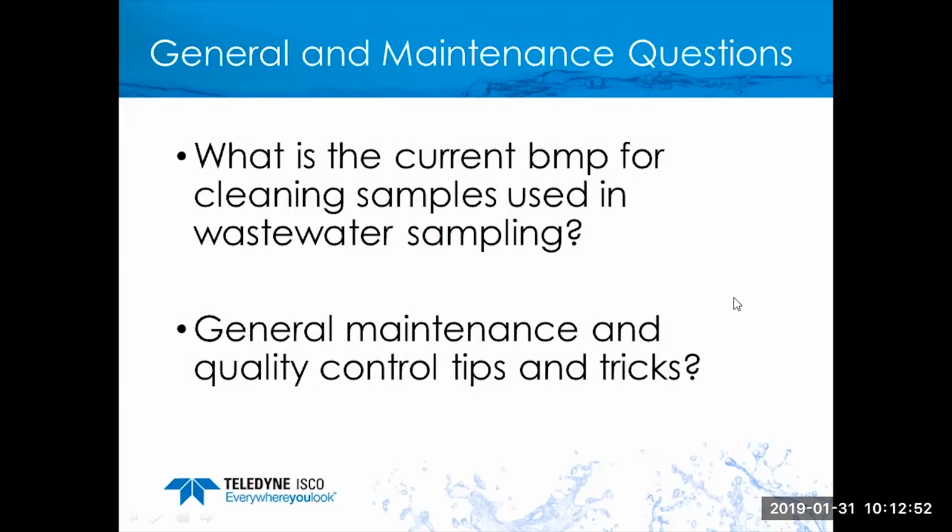Some of these are fairly simple. What is the recommended maximum fuse amperage for sampler battery leads when using a marine battery? Well, a lot of this, again, depends upon which specific sampler model is being used. Not all samplers draw the same amount of current. So my knowledge is based and steeped in ISCO samplers.